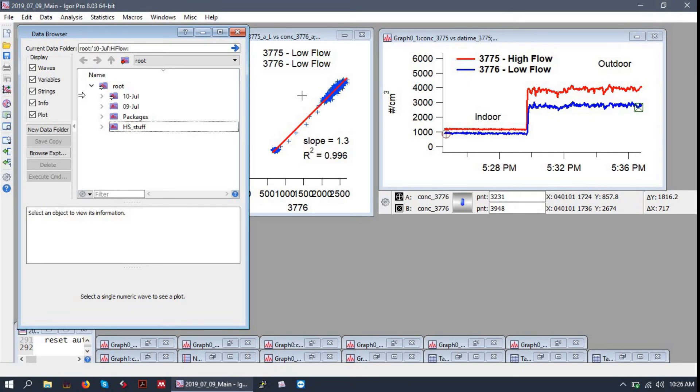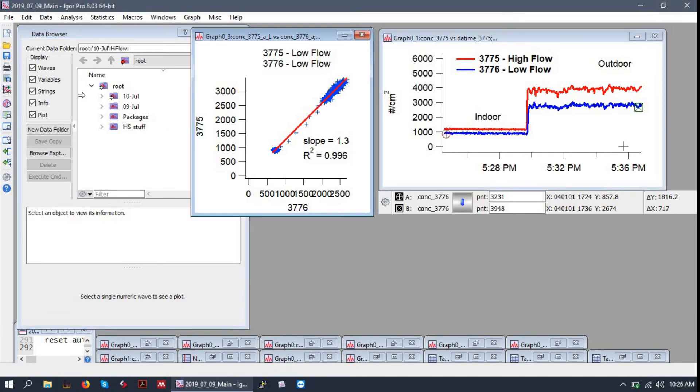I think that about does it for this example file. Next, we'll open up a blank experiment and go from there.